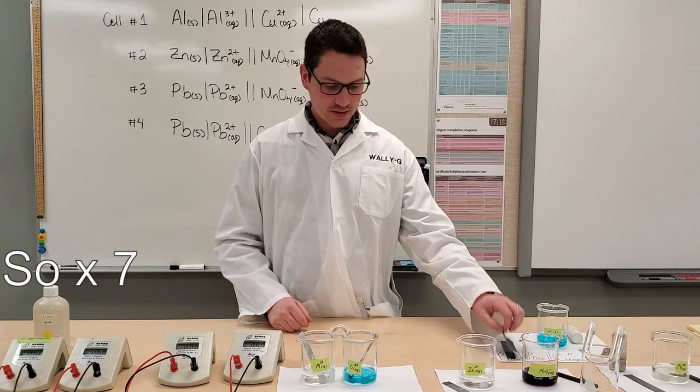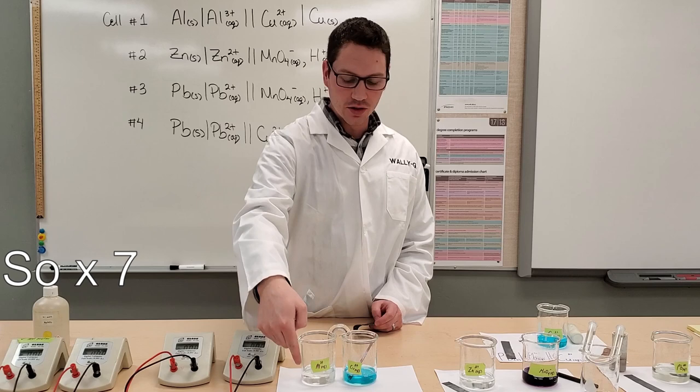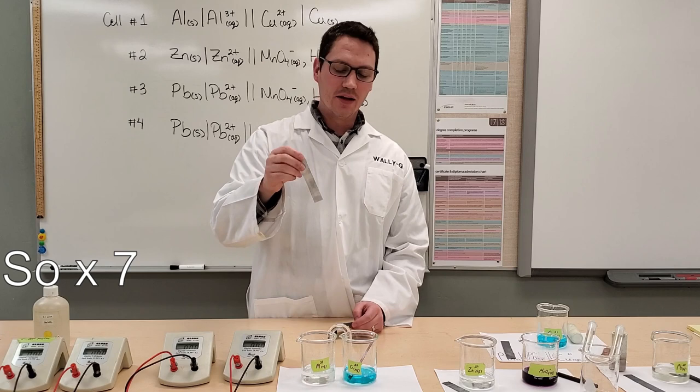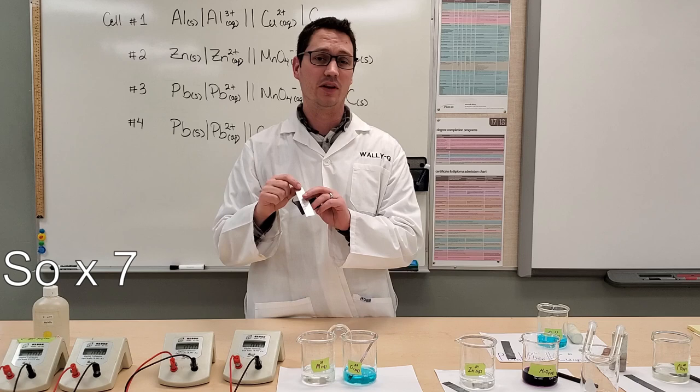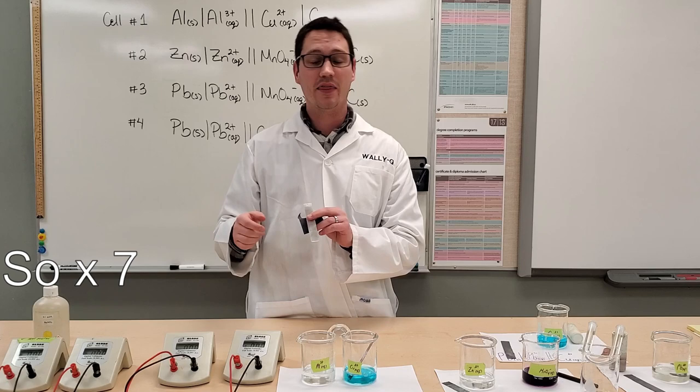And then all we need to do is put our electrodes in their respective half cells. Before we do this, here we've got aluminum. We're going to put aluminum electrode in the aluminum ions. And what we need to do is sand down the oxide layer on the outside of the electrode. If we have an oxide layer on the outside of an electrode, it can inhibit the flow of electrons and actually reduce our cell potential that we eventually get.